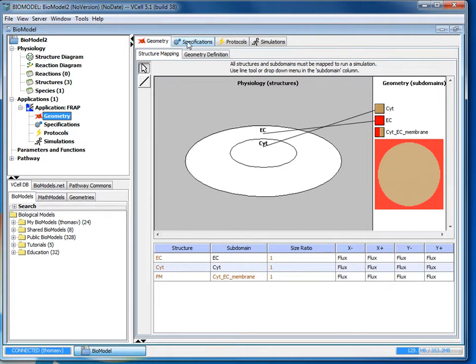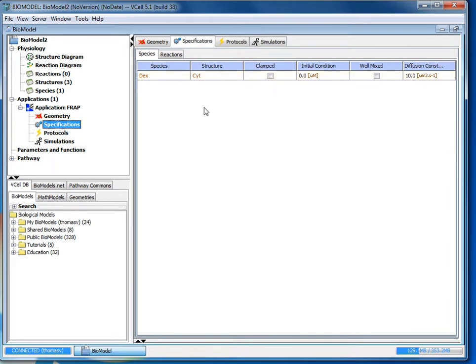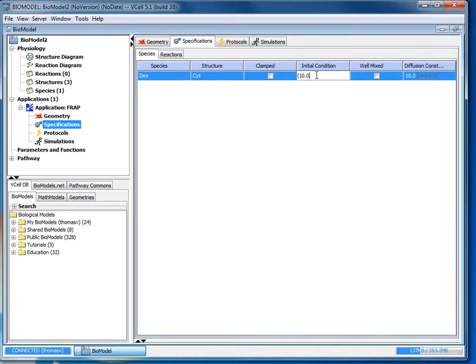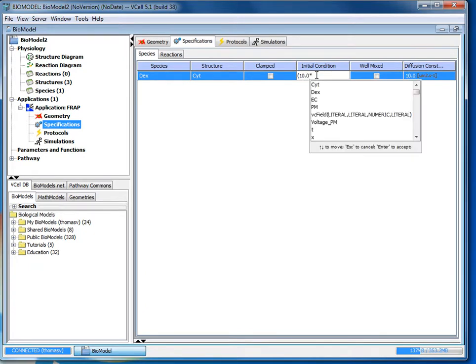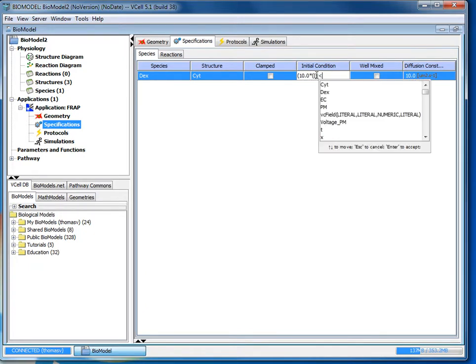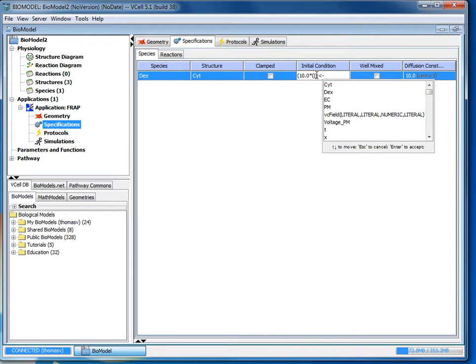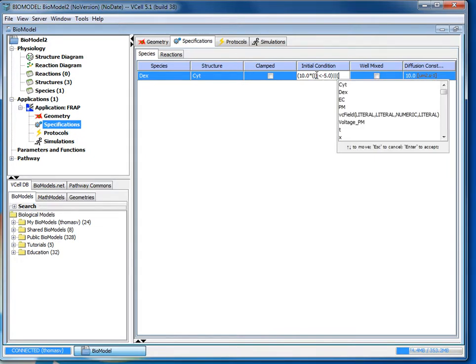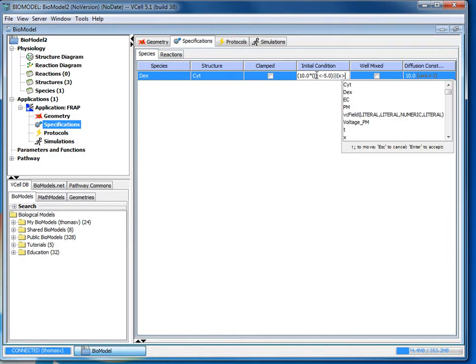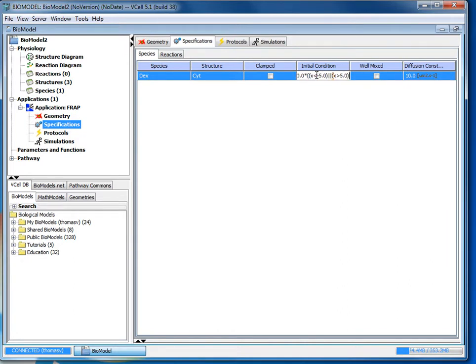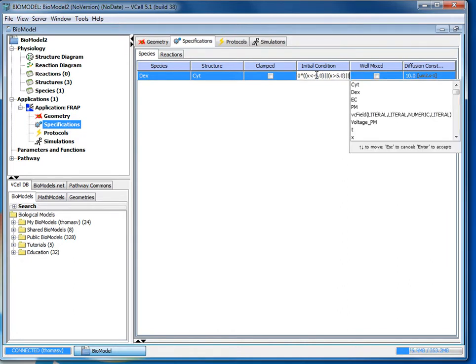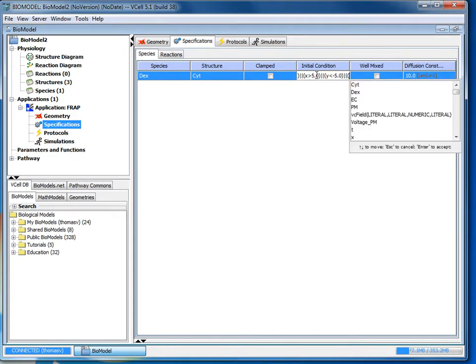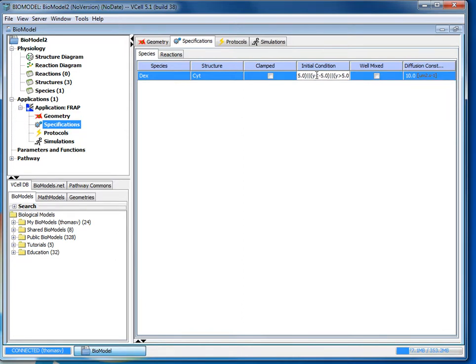Next we're going to go to specifications to set our initial conditions. And in the initial condition box, you're going to double click. And then we're going to enter in the following equation, which is 10.0 times x is less than negative 5.0 double bar, x is greater than 5.0 double bar, y is less than negative 5.0 double bar, and then y is greater than 5.0.